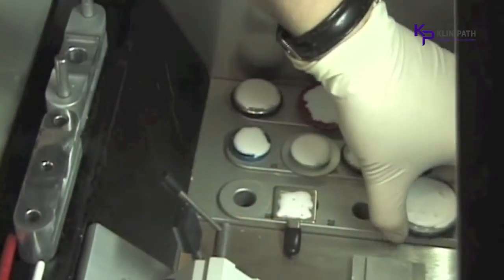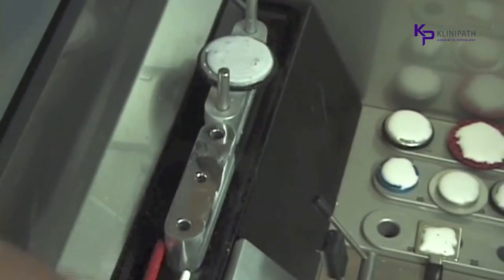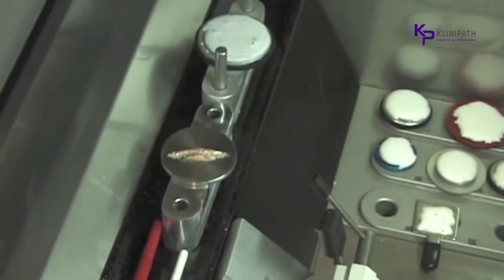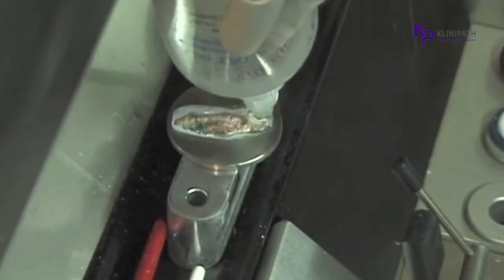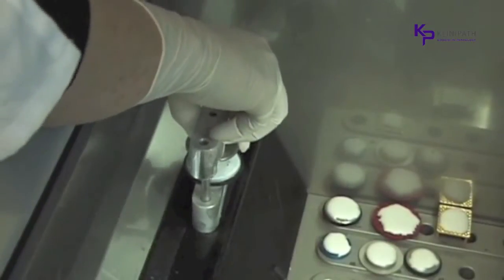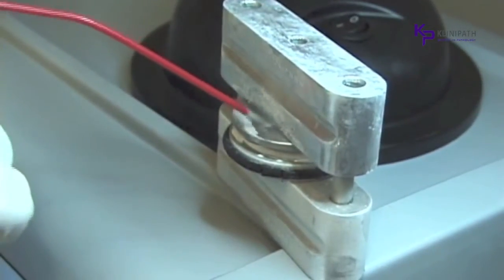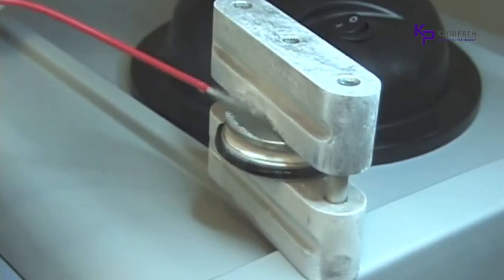There is a large flat disc included in the Cryoembedder system for larger specimens. It will accommodate tissue that is the length of a microscope slide. The embedding process for the larger specimens works the same as with the smaller discs. The transfer of temperature through the metal disc into the tissue will not cause crystal artifact, as sometimes happens with tissue that is dipped into liquid nitrogen or sprayed directly with freeze spray.